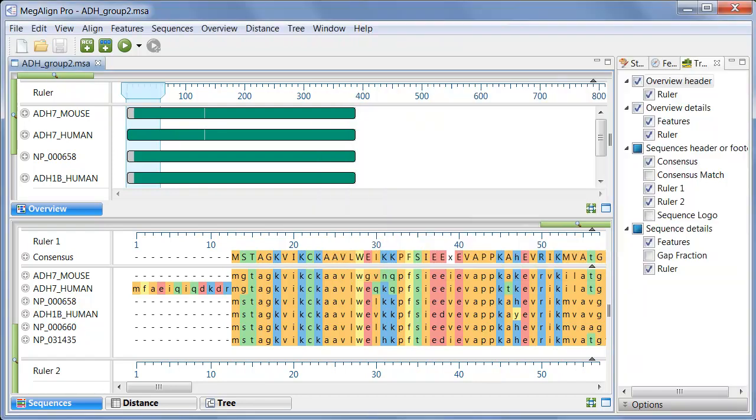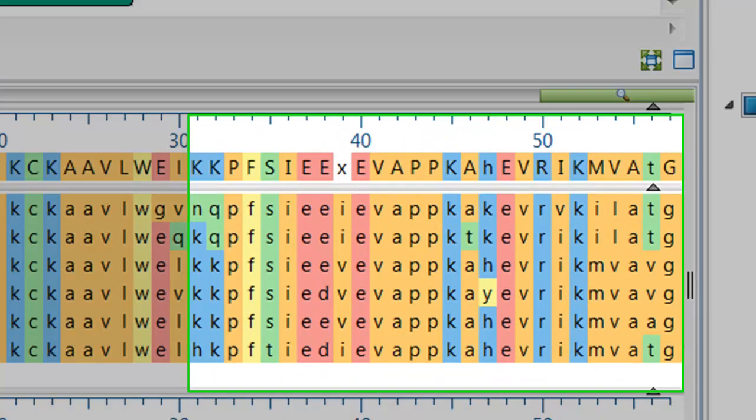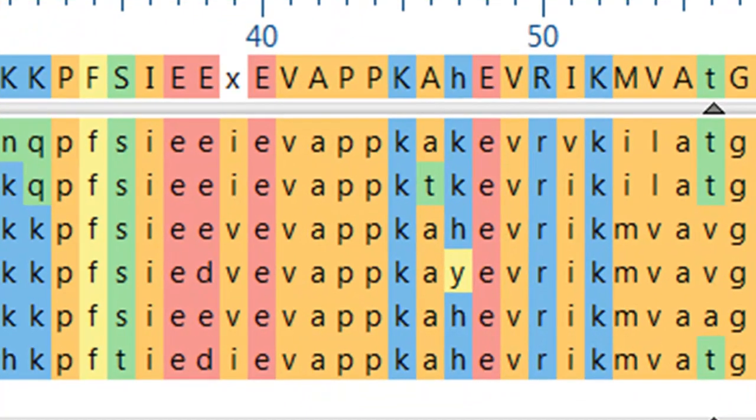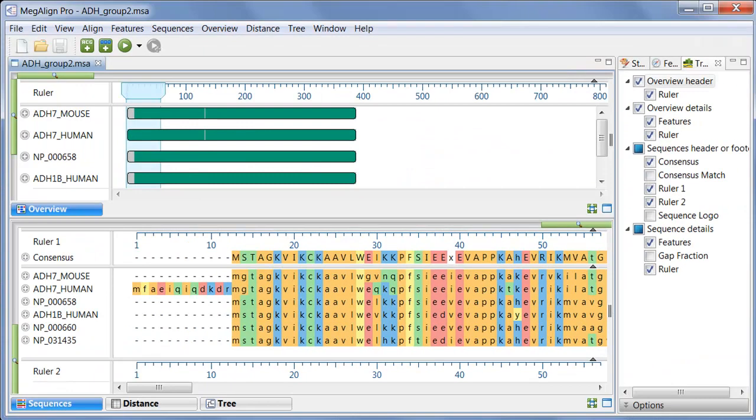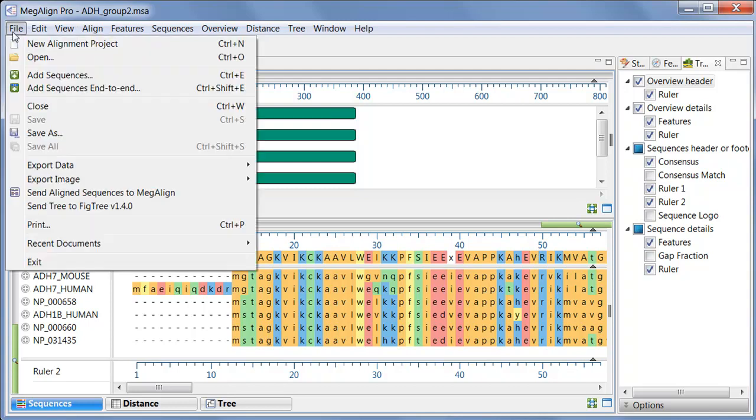In this and all workflows discussed in this video, all sequences must be of the same type. In this case, the alignments both use protein sequences. Before aligning, I'm going to use File, Save As, so my merged project won't overwrite my existing project.